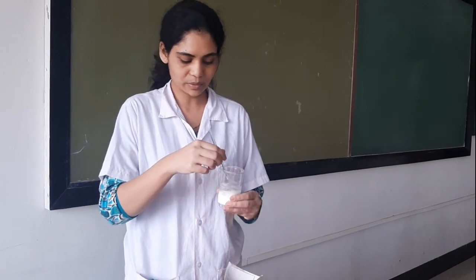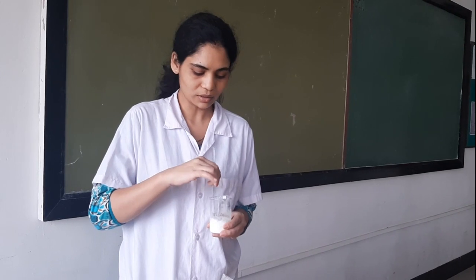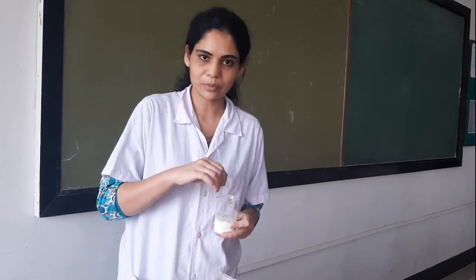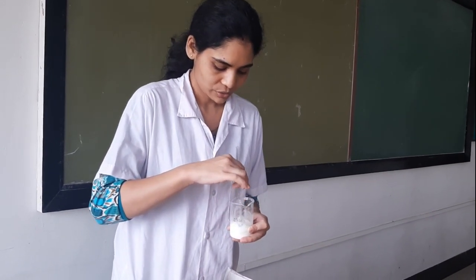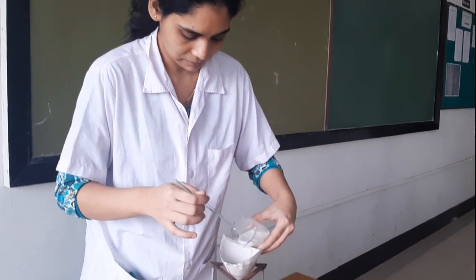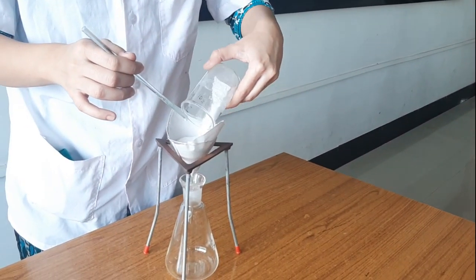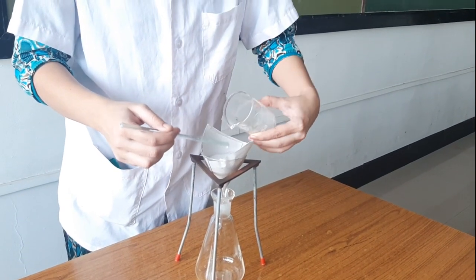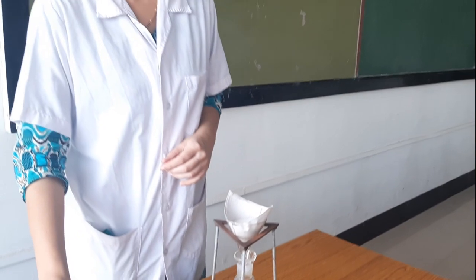We have again arranged the assembly, and now we will be passing the 10% calcium carbonate solution to the filter medium. Now we are going to calculate what amount of time is required for the complete filtration of the 10% slurry. So again we will stir the slurry and we will pour it.